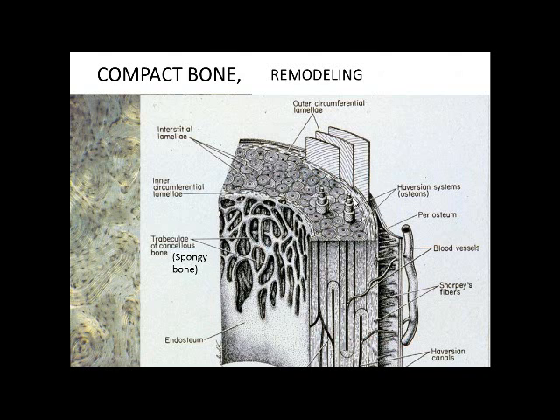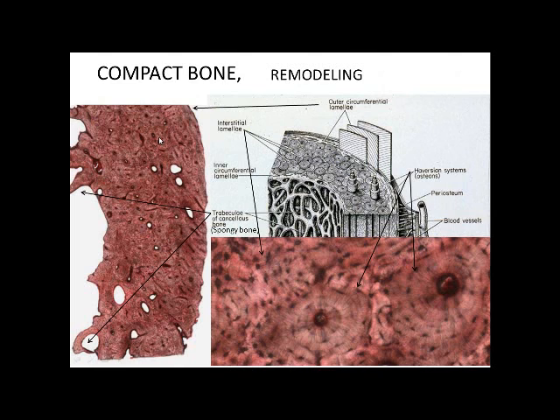Sometimes you have bone being laid down appositionally from the outside — those cells differentiate to make bone cells, and we call these outer circumferential lamellae. On the inside you have inner circumferential lamellae, where bone develops from the mesenchymal cells in the endosteum. So bone grows in width from the endosteum and from the periosteum. The channels that form the osteon are made by osteoclasts, which create a hole that osteoblasts then fill in.